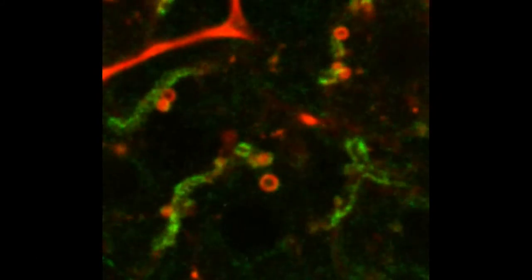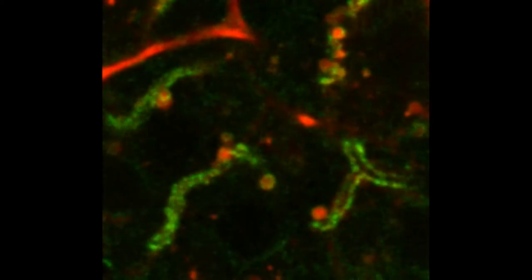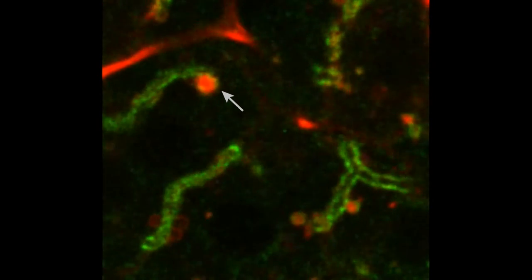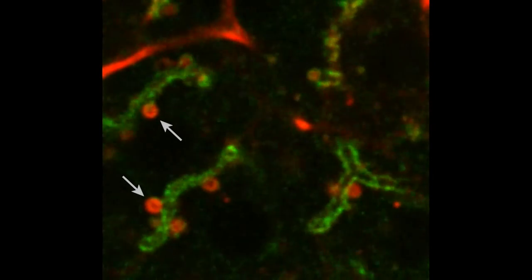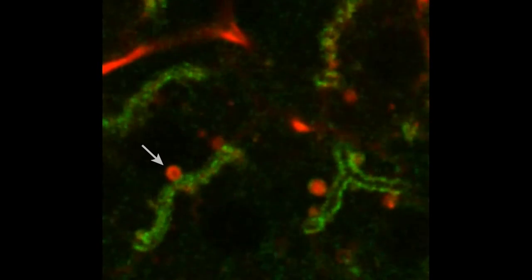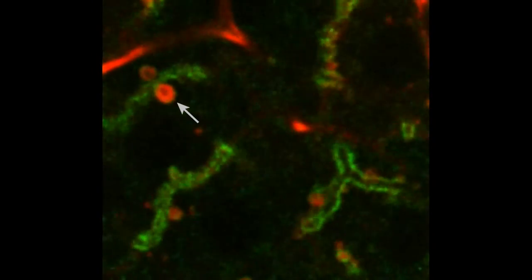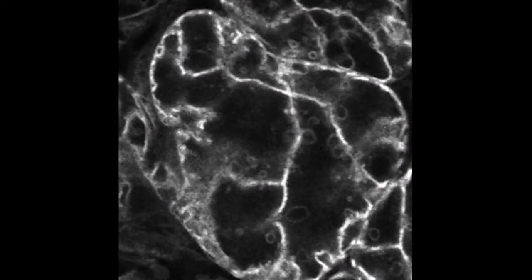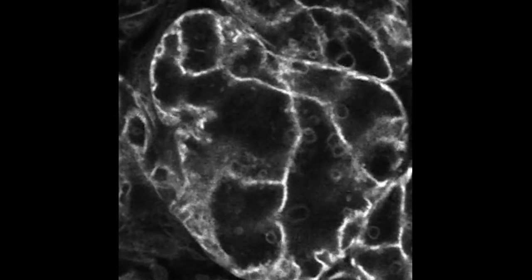We can also image how myosin-2 jumps on the granules after the actin filaments are assembled. In this video, we used a mouse that expresses fluorescent actin in red and fluorescent myosin-2 in green. The vesicles integrate into the plasma membrane after myosin-2 is recruited, but in mice engineered to not express myosin-2, the integration is stopped.